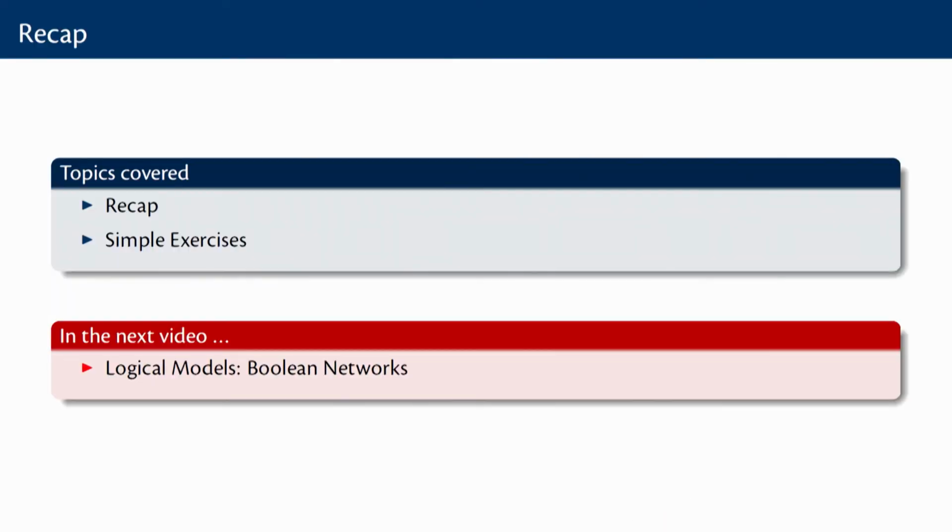Thank you. In this video, we had a small recap of the GCMS techniques that we followed, and we also did a couple of small examples that dealt with the data obtained from GCMS, and looked at how to do calculations using the data that we obtained from the experiments that we carried out.